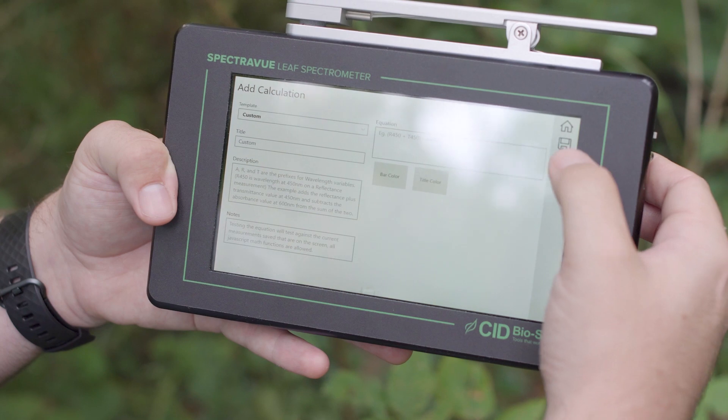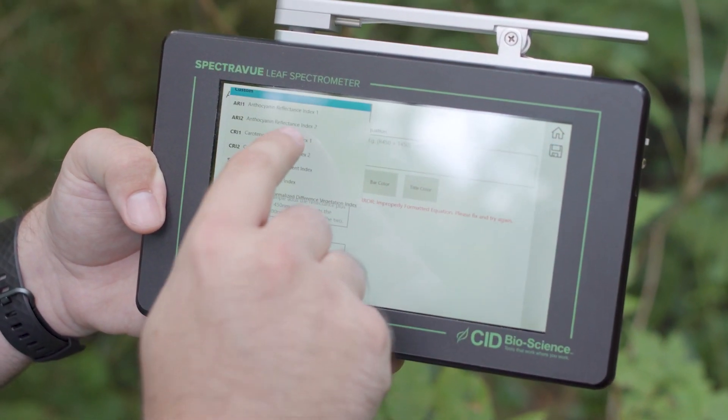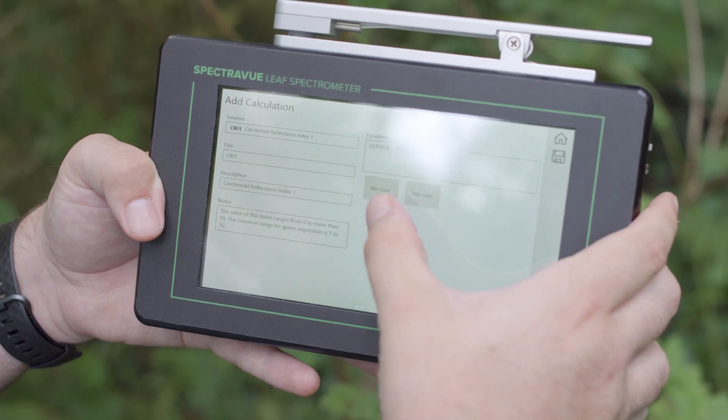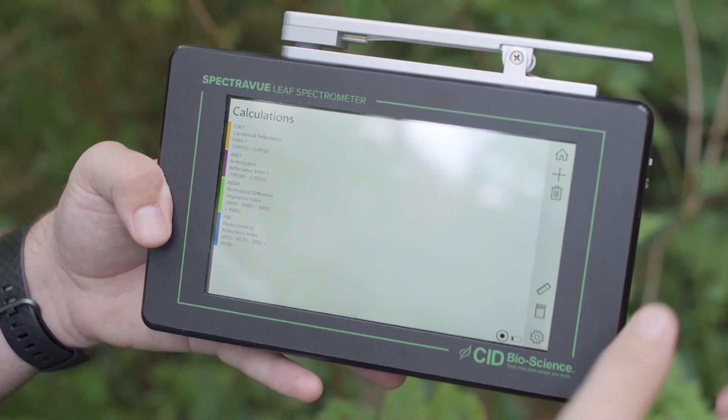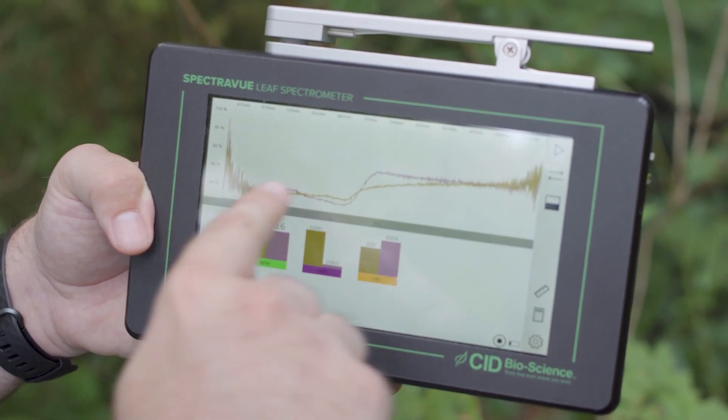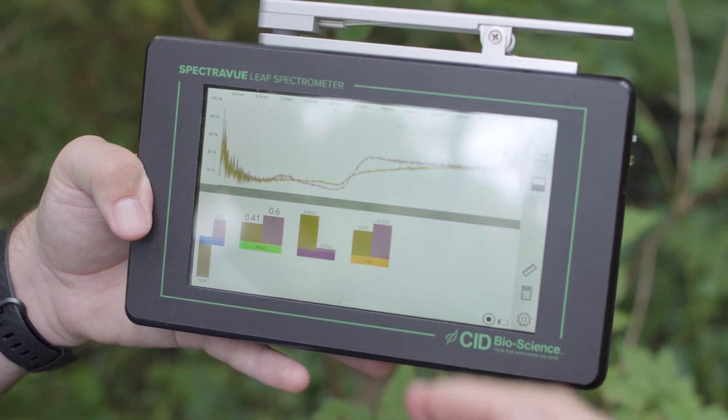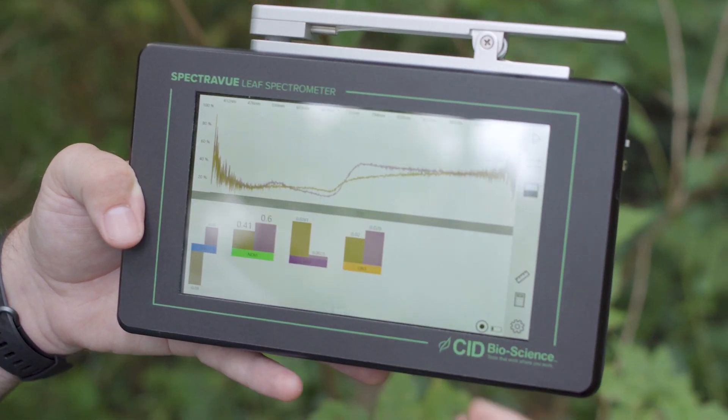When you go to save that, for instance, let me choose carotenoid reflectance index one. You can click save, that'll be saved, and when I go back to the home screen, you'll see that index has been added. Because I have the spectra here, that has been back calculated for us, so we can see the values for this index for the previously taken measurements.